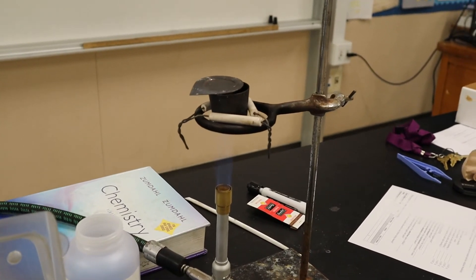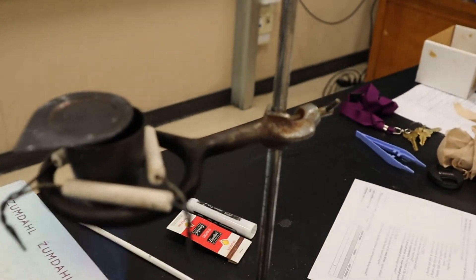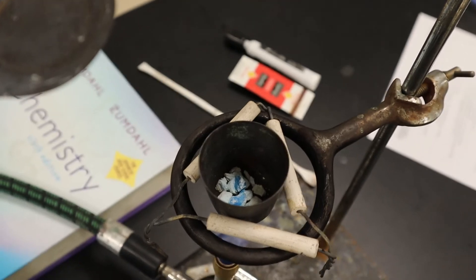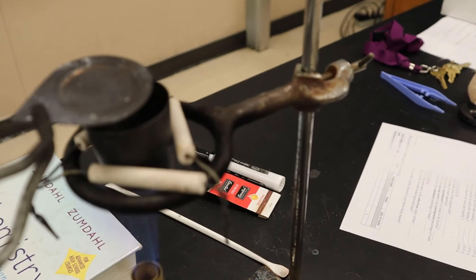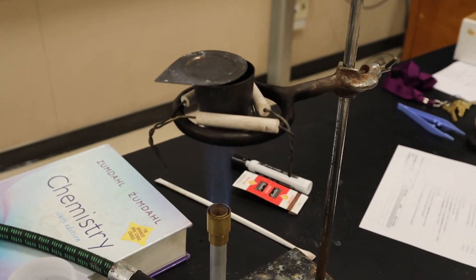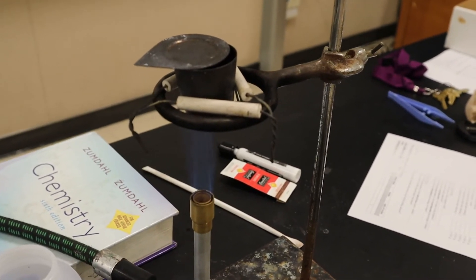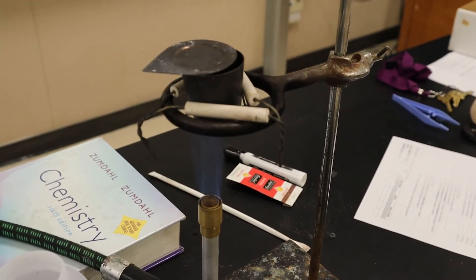I'm heating up the crucible now. If you look inside you'll notice that some of it is still blue. I want to heat it until it becomes white — when it becomes white, it has driven off all the water. The reason it's blue is because of the water combined with the copper sulfate.